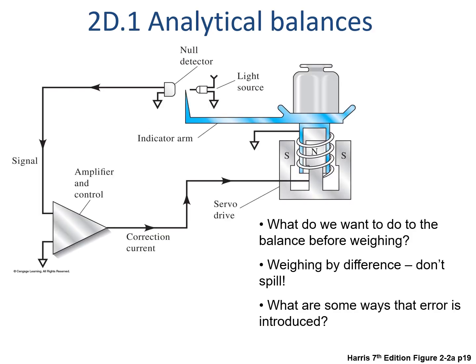A modern analytical balance actually measures force, like weight, not mass. Even more specifically, it measures how much current is needed to apply an appropriate force to keep the weight in the same spot. However, we always calibrate these based on mass standards, which is why we can measure mass with them. Because the current required to preserve that sample location is dependent on any drag in the balance, it's really important that the balance be clean, otherwise you might get a false reading. So clean up any spills immediately. The instruments also can drift, so it's important to re-zero or tare between measurements.